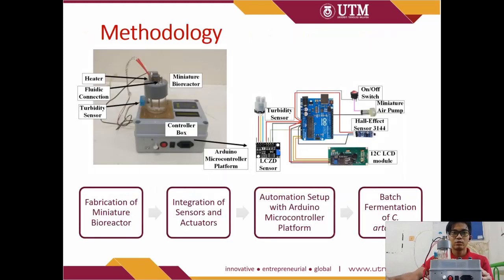Okay, from here I want to talk about the methodology, how to make this product. The first step is fabricating the reactor vessel by using PDMS or PMMA plastic. It will give the disposable element to the reactor vessel. And the second step, fabricating the controller box by integrating the Arduino microcontroller platform.